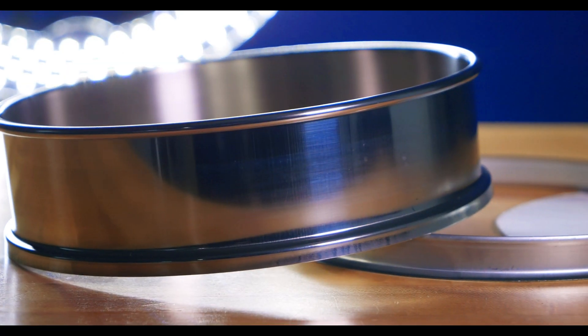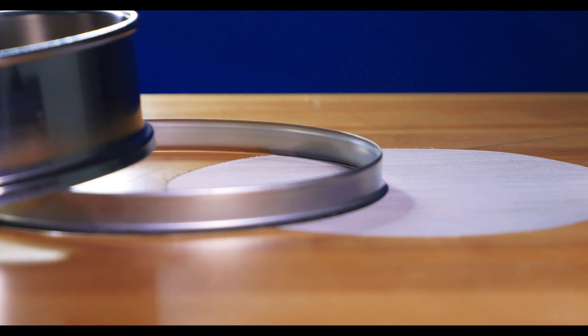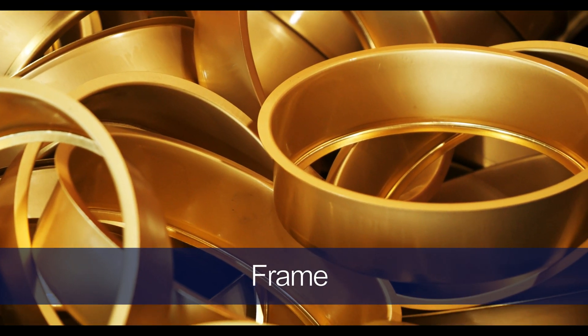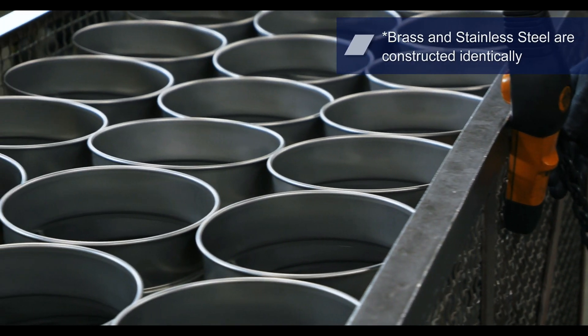Testives consist of three main components: a frame, a skirt, and the screening media. The frame is used to provide space between testives when stacked, which allows the material being tested to move freely.